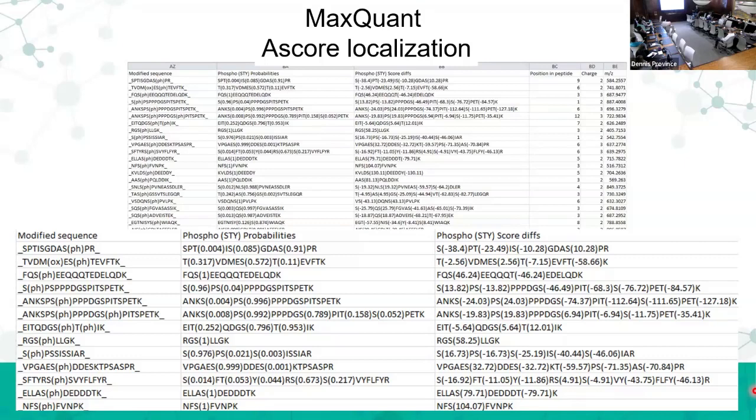We play the odds game. It's likely the one that's highest. Sometimes, I don't know if there's one on this list, sometimes there'll be a case where two of them have 50%, right? It's one of the two. We just don't know which one. And so we'll report data with these percentages, and that's what they mean.